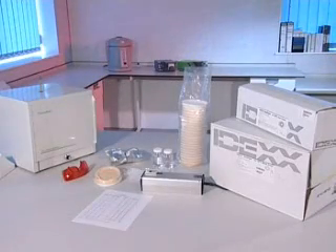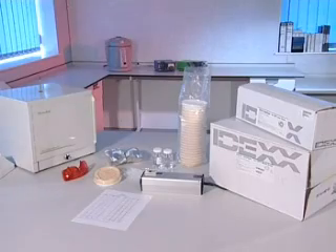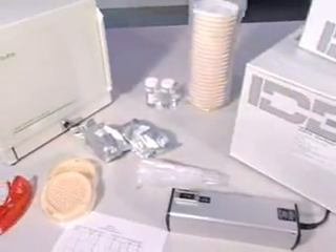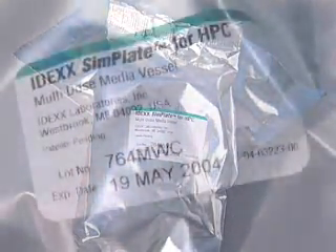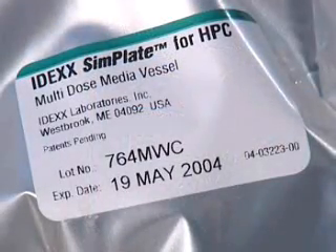IDEX's SimPlate for HPC method is used for the quantification of heterotrophic plate counts, HPC in water. It's based on IDEX's patented multiple enzyme technology, which detects viable bacteria in water by testing for the presence of key enzymes known to be present in these organisms.